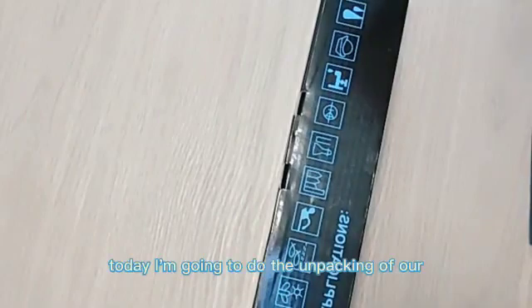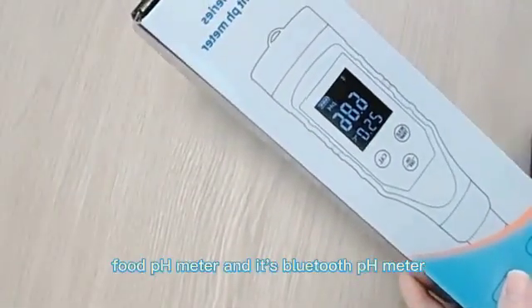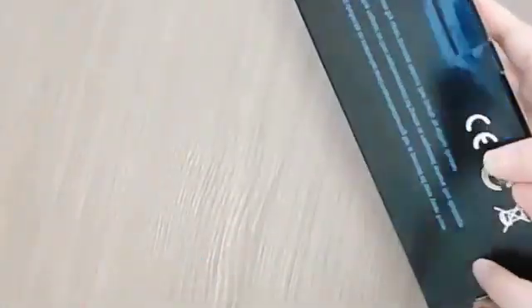Hello dear friends, today I am going to do the unpacking of our YY1030 food pH meter and its Bluetooth pH meter.